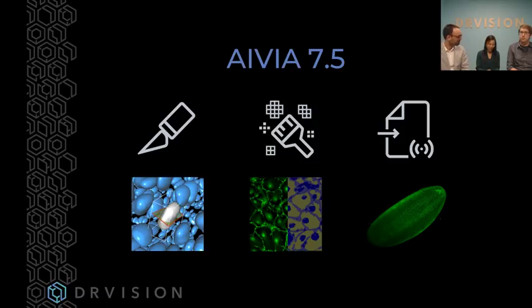Yep. Okay, all right, and then I think I have one last question here. Well, maybe two. For the mesh splitter that you showcased here, is there a redo and an undo button? Yes, actually, I did show that. You can undo and redo everything, all the cuts that you make. Basically, it's just Control Z, Control Y, and you can undo and redo. And you can see that very clearly because the colors change, so it's very easy to spot.